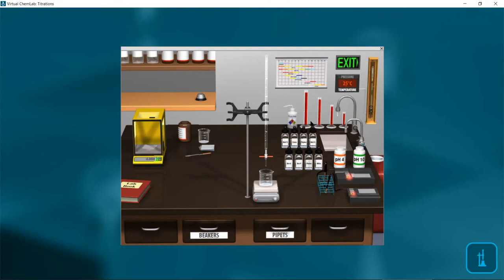And before I pick it up, over here are two water taps at the sink. Notice the first one, you see a little green tab. And if you look closely on the other side, there's another knob. This is what I call city water. This is standard water like you have in your bathroom, but the curved tap has only one handle, and this is deionized water. Ions that are in water, I'll teach you more about, we've talked a little about it.